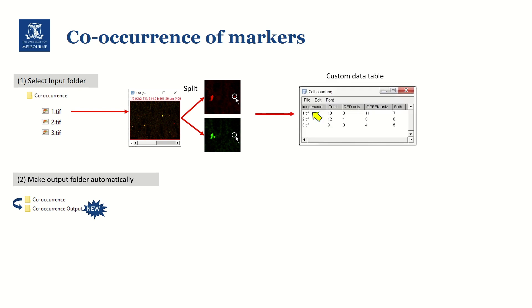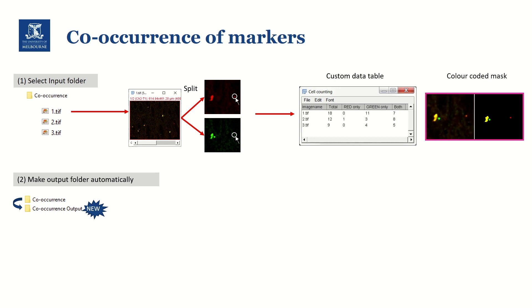Then we can log this counting result onto our own result table. Unlike the default result table from ImageJ, we can set what we want to log in this table. So from each image, we will log the image name and how many cells we have detected in total, and the breakdown of each group — how many cells are positive to only red, positive to only green, or positive to both. Also in this example, we will make a proof image that shows the raw image and our counting result combined together, so we can double-check the result visually. The double-labeled cells will be colored as yellow and single-labeled cells will be colored either as green or red to show which cell was counted in which group.